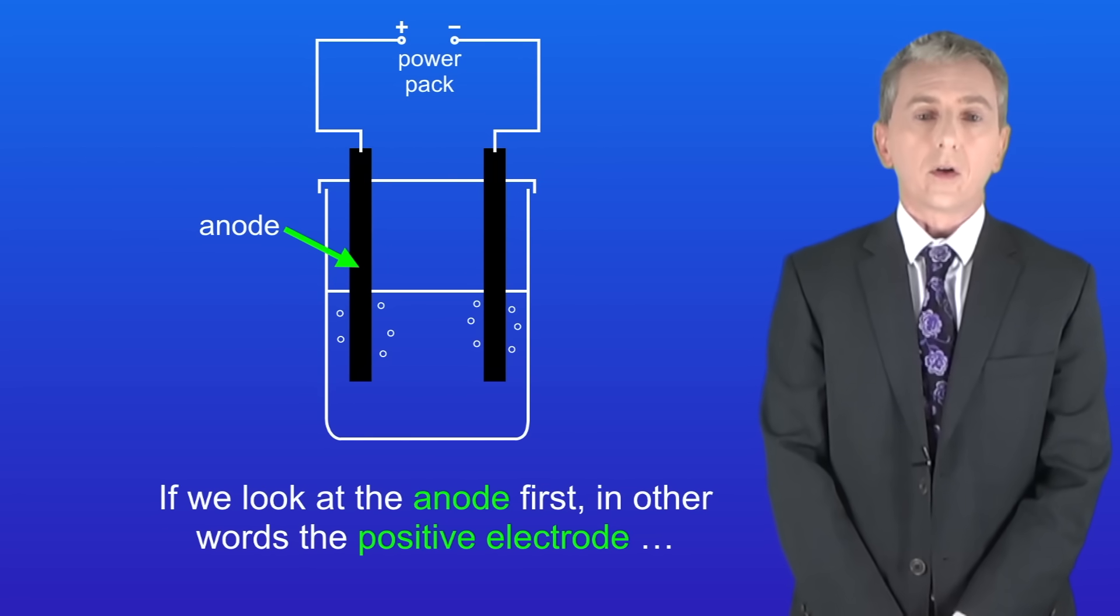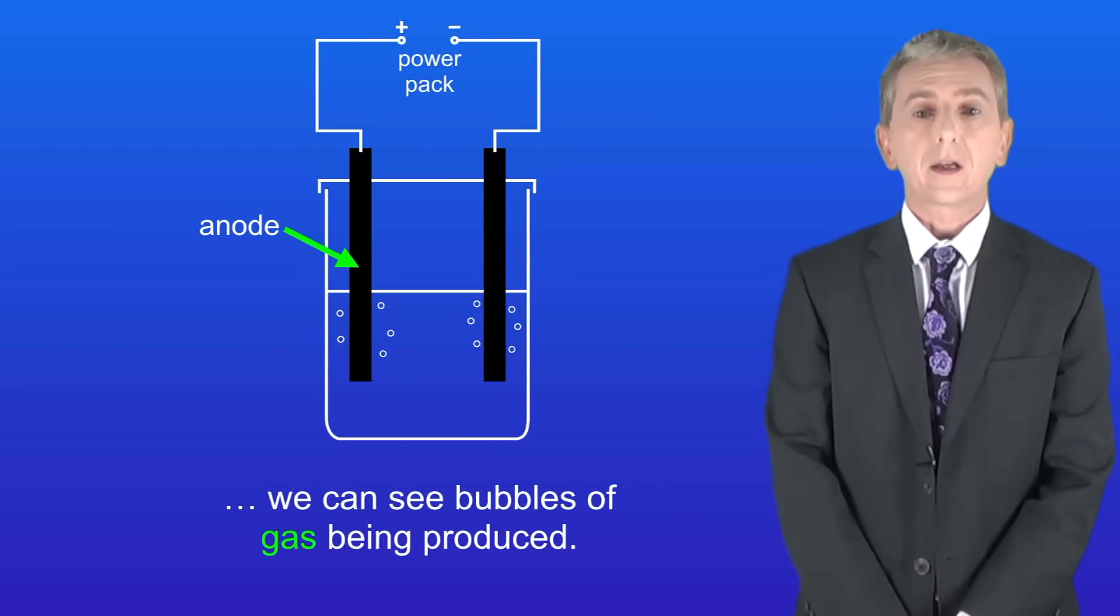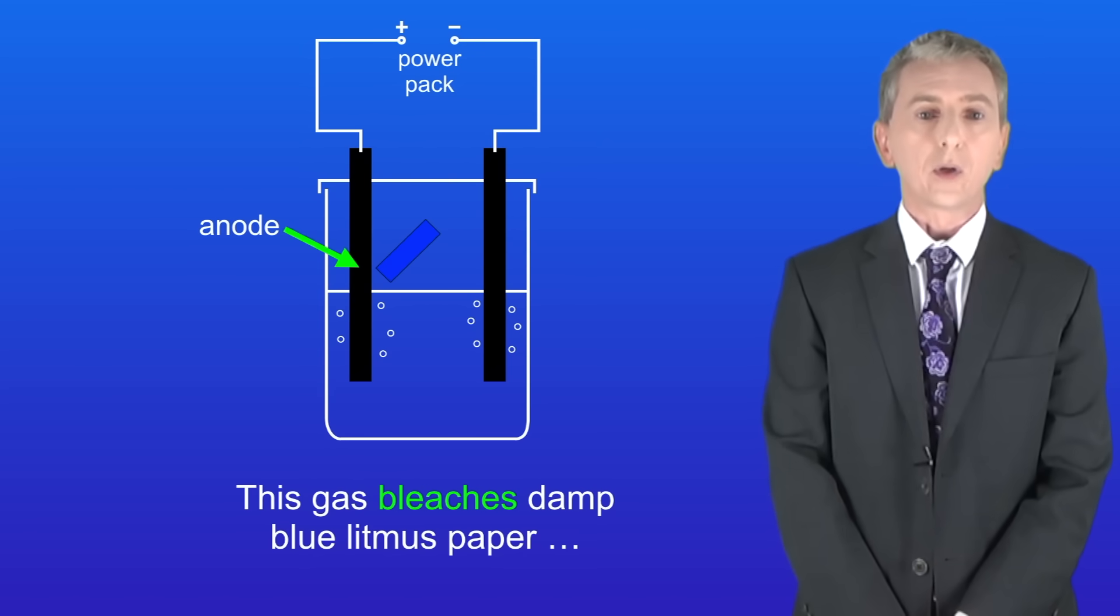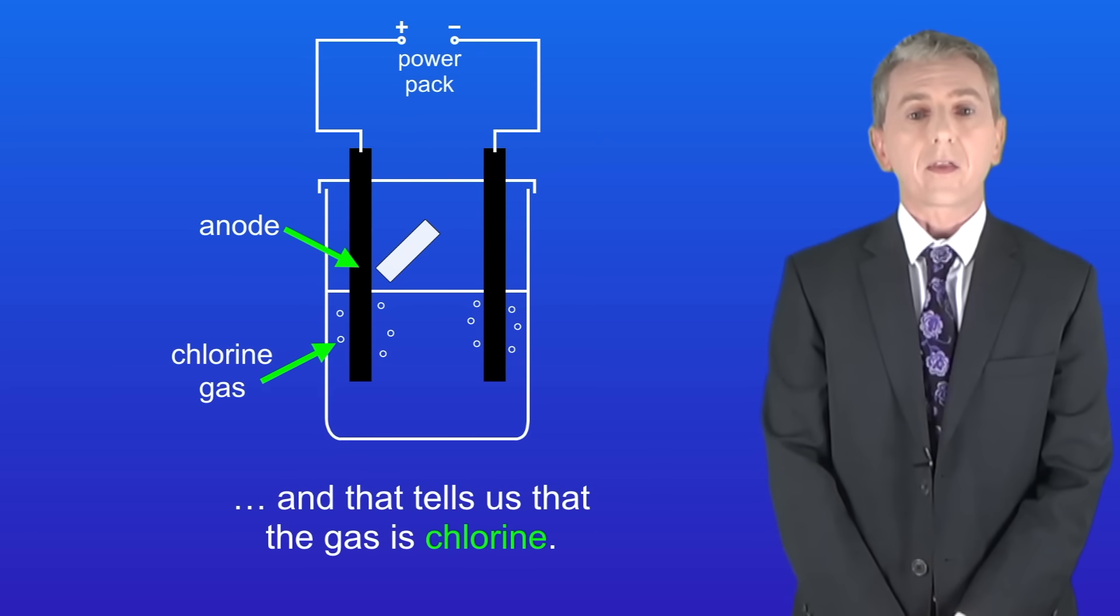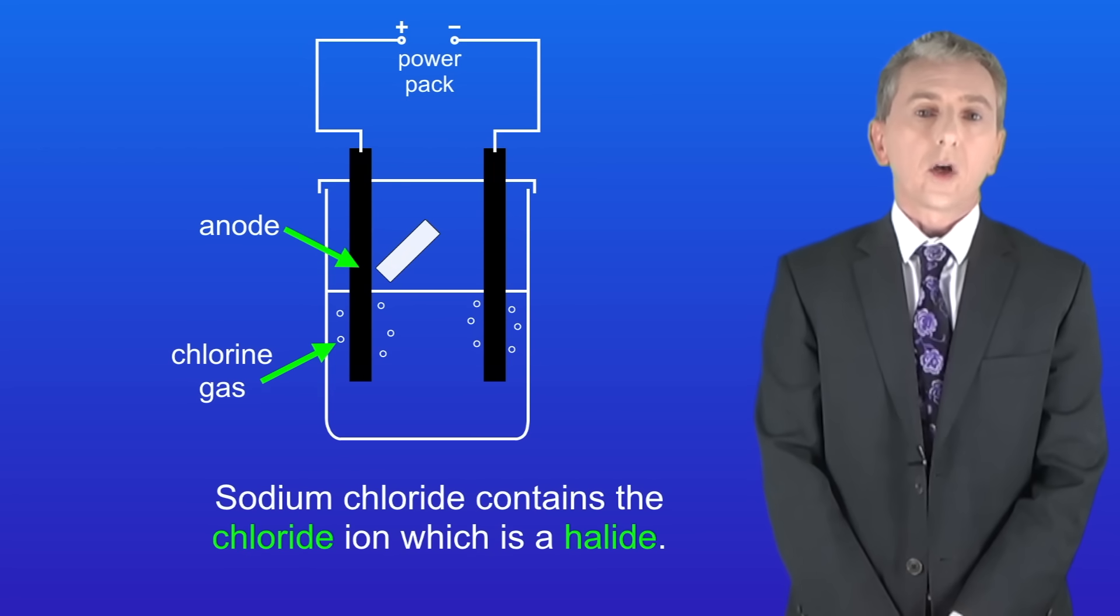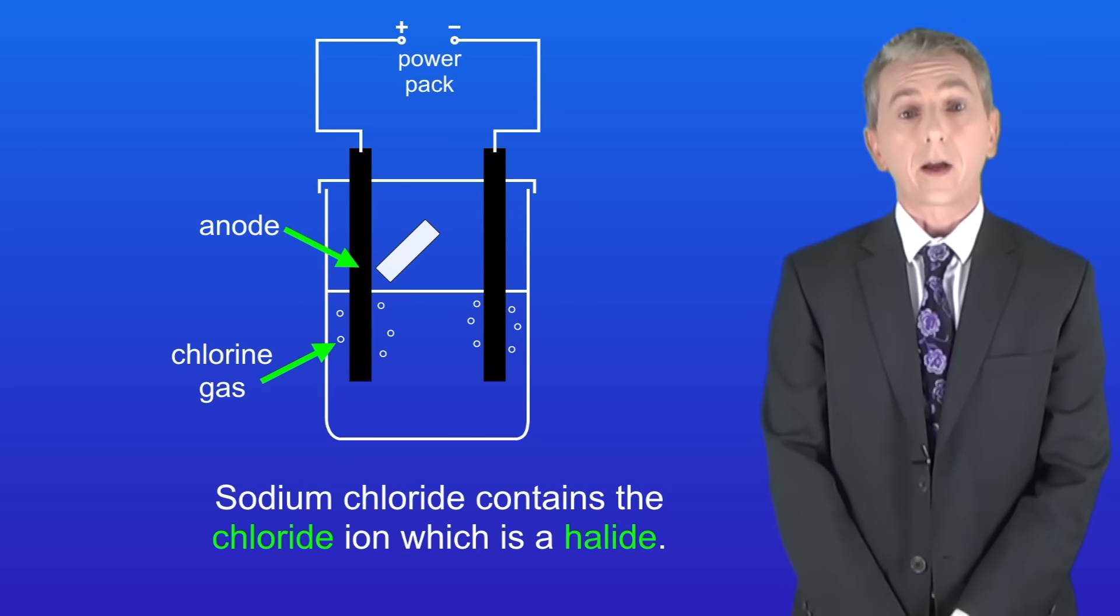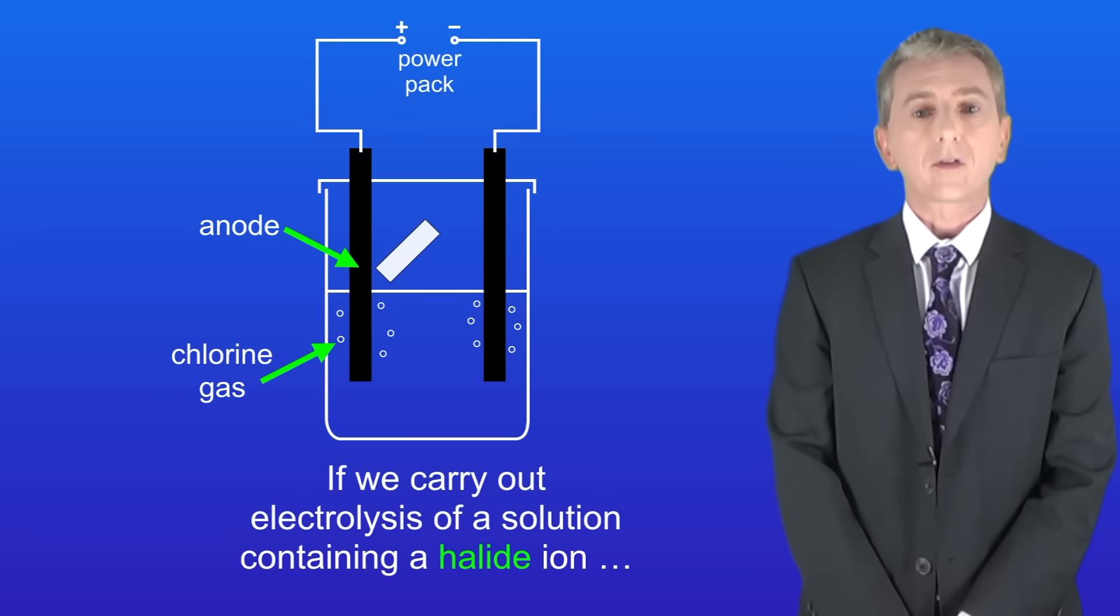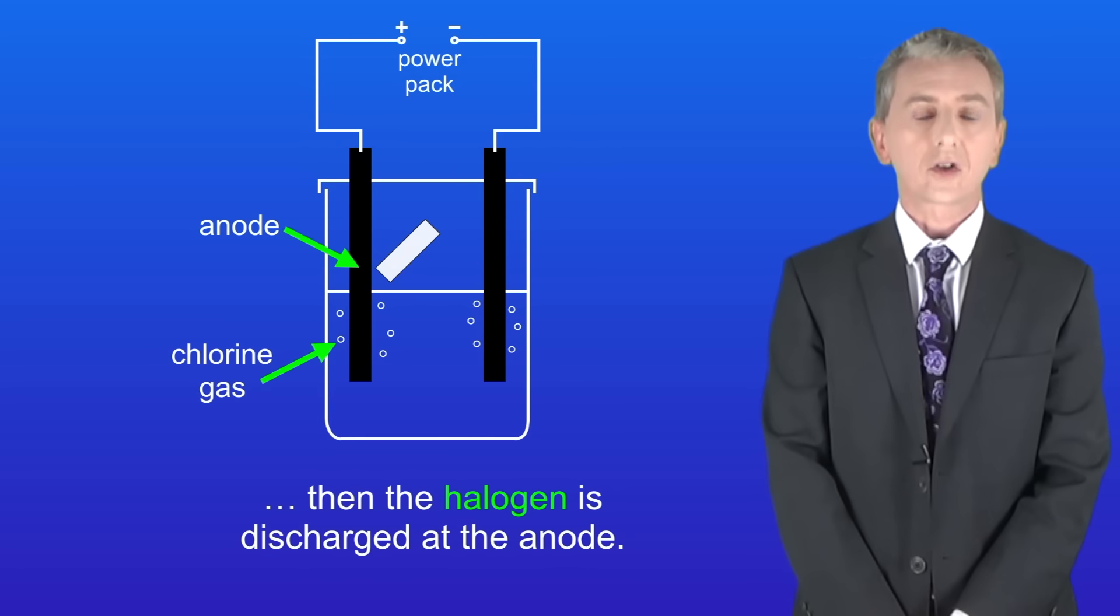If we look at the anode first, in other words the positive electrode, we can see bubbles of gas being produced. This gas bleaches damp blue litmus paper and that tells us that the gas is chlorine. Sodium chloride contains the chloride ion which is a halide. As we said before, if we carry out electrolysis of a solution containing a halide ion then the halogen is discharged at the anode.